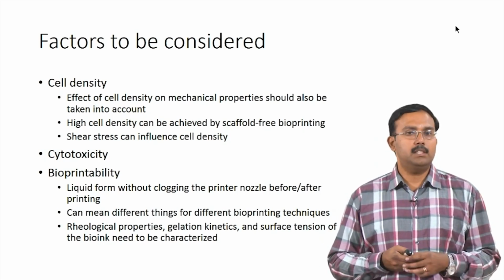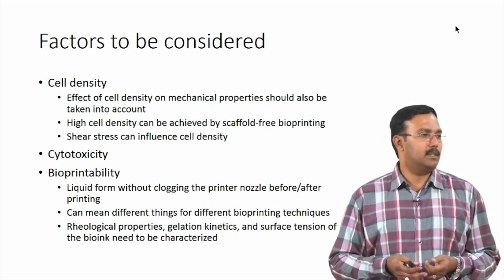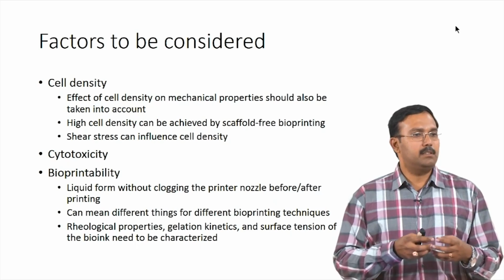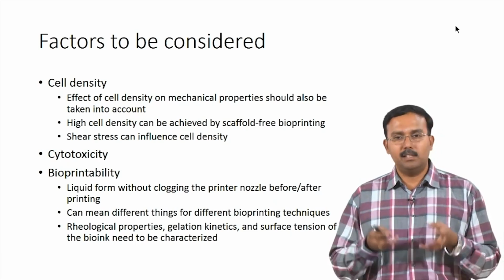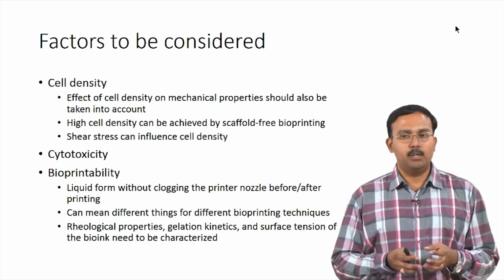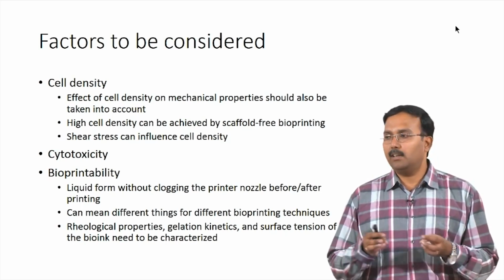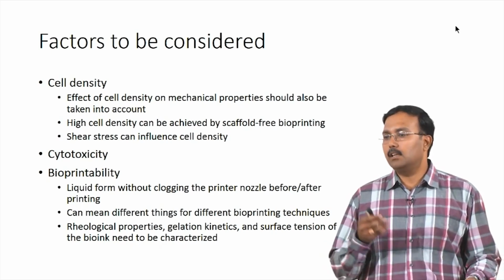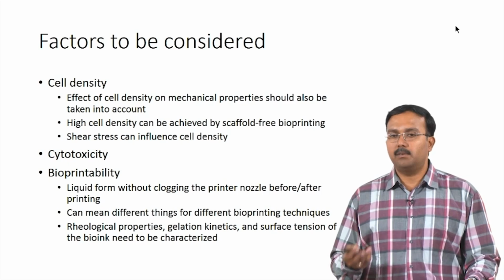Cytotoxicity of the ink has to be taken into consideration. Obviously, it is not just the polymer you are using, you might have a solvent, you might have other additives which are present along with the polymer. So, you would have to take all of that into account while you are printing. The cytotoxicity of all the components has to be looked at.